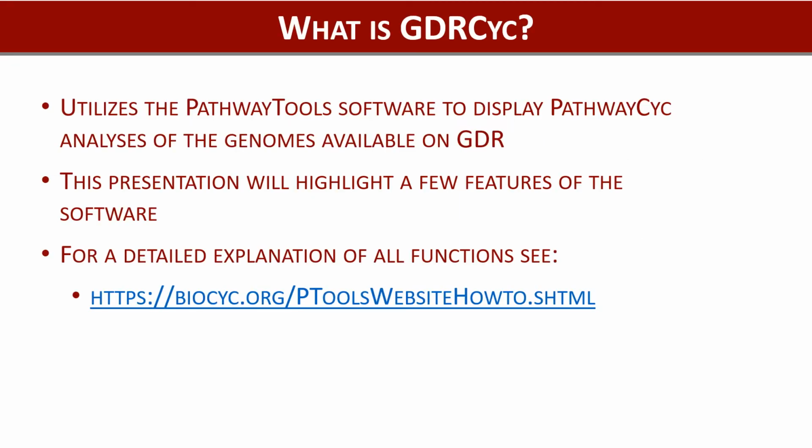GDR-Cyc utilizes the PathwayTools software to display PathwayCyc analyses of the genomes that are available on GDR. I can't cover everything that the PathwayCyc software does, but I'm going to highlight a few of the more useful features in this presentation. For a detailed explanation of all the functions that the PathwayCyc software does, I highly recommend visiting their documentation. This link is also available under the Help menu in the GDR-Cyc.